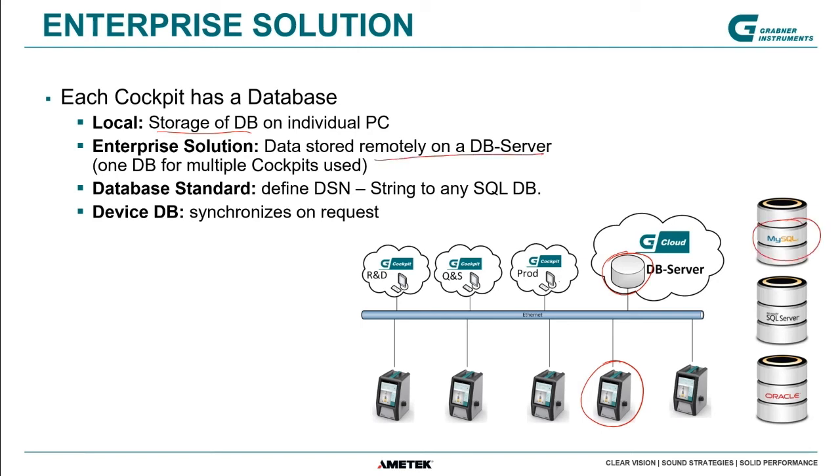And this can be a MySQL, SQL Server, Oracle server, or IBM DB server, whatever. It's working according to database standards. You just need to have a data source name string, and then you can connect it. The device database, so there's also a small database on the device, is then synchronizing the data with this, and with every computer you can access either the data from all the devices or the individual instruments.